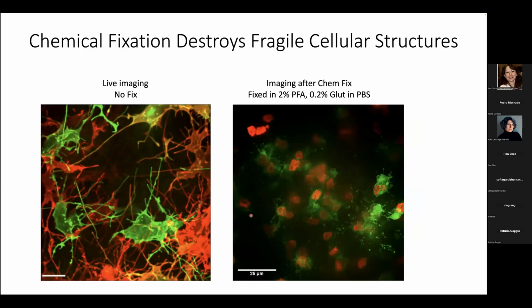When you add fixative, glutaraldehyde, even at a low percentage, you begin to see the disruption of these cytonemes; they break apart and disappear. This led to confusion in the field, because people said maybe they're not real, since we can't see them with EM and fixation. But then we got these great live light techniques and can see them, so they must be real.